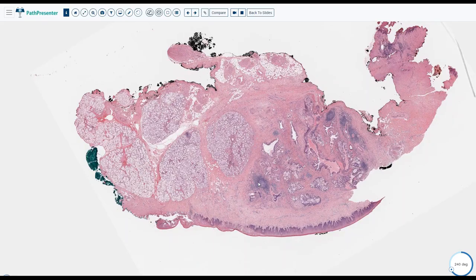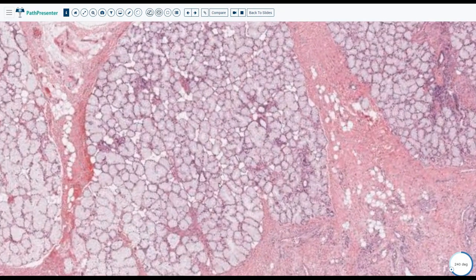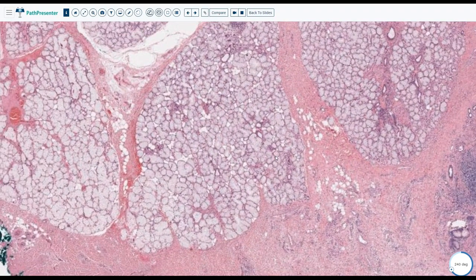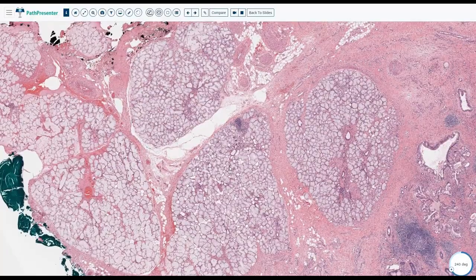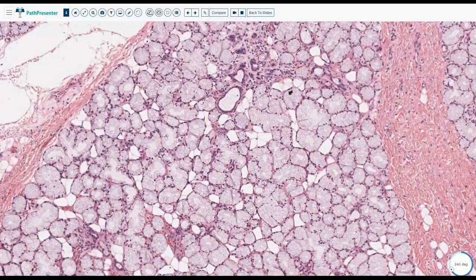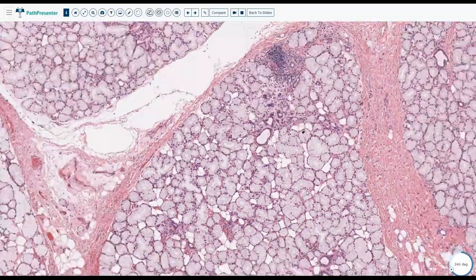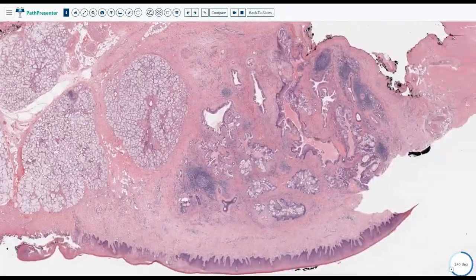All right, so we are talking now about a minor salivary gland, and this could be around the lingual area, meaning that we have a lot of these. I don't know, it's not buffering well. Well, we have mucinous secretion, yes, mucinous type. Of course, when they are exposed to alcohol, they will be wiped out. Okay, so we have that here, and then we have this.